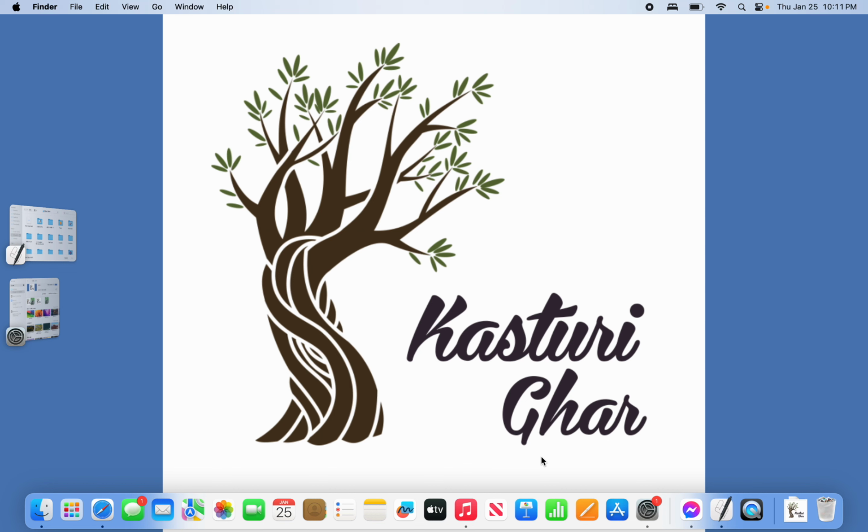Hey everyone, welcome to Kasturi, and today we are going to learn how to use ImageJ, that is Fiji, to analyze the western blot bands.